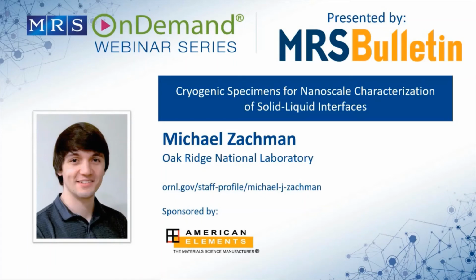So, yes, we were using a gallium FIB, and I do think that it is not ideal, honestly, because while you're at cryogenic temperatures and you can get a much lower reaction rate with gallium, which sometimes can interact with materials, especially with lithium. Lithium can be really bad. It basically stops that, but you can still get gallium implantation. And we would often find these gallium-rich sections at the very bottom of the lamella kind of hanging off. So if by chance you're interested in something down there, it could interfere. So to avoid that kind of thing, I think that going to a plasma FIB would be very useful.